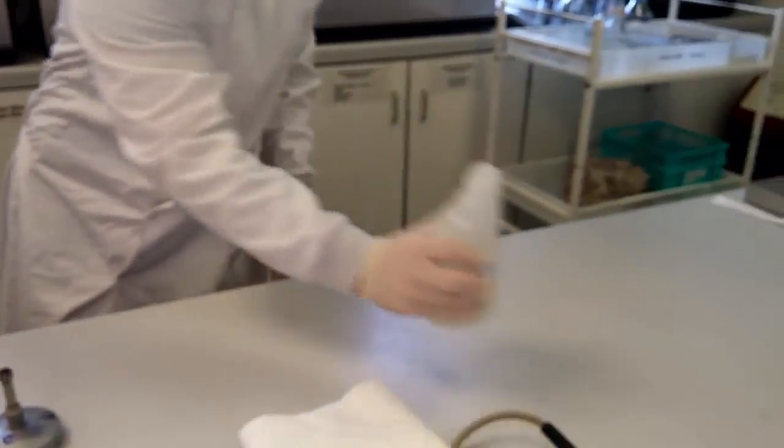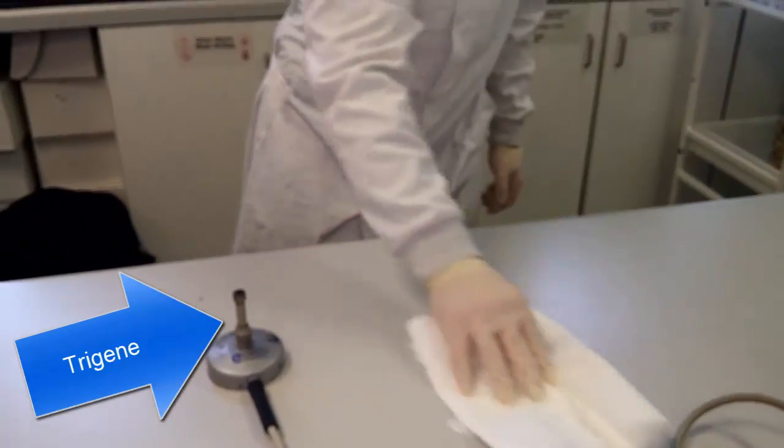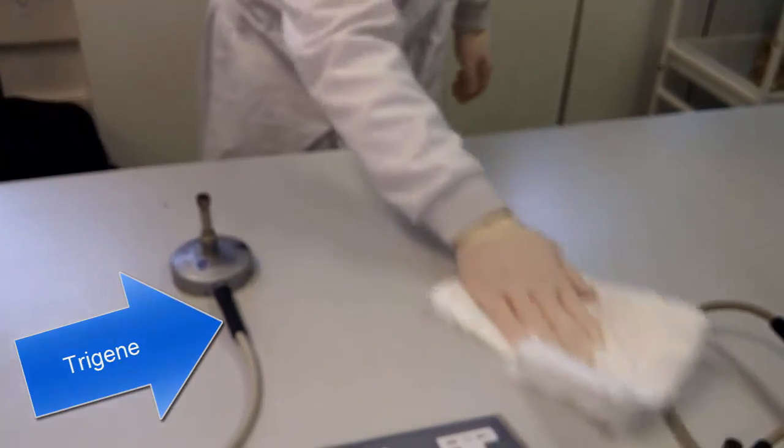First of all, we are going to perform some lab safety procedures, such as putting on a lab coat, washing your hands, putting on gloves, putting on safety glasses, and using aseptic technique.